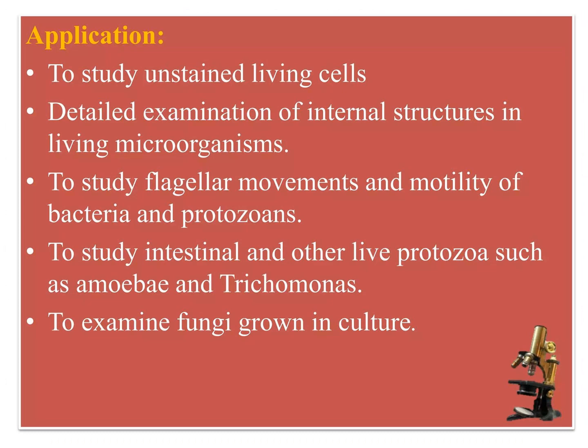Application of the phase contrast microscope. First, to study unstained living cells. Second, detailed examination of internal structure in living microorganisms. To study flagellar movement and motility of bacteria and protozoans. To study intestinal and other live protozoa such as amoeba and trichomonas. To examine fungi grown in culture.